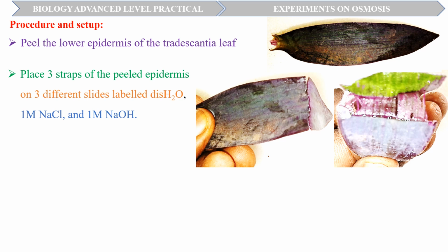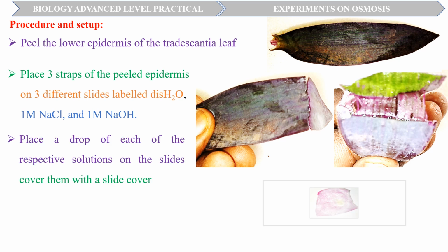Apply a drop of the solution on the slide. Cover with a slide cover and quickly observe under the microscope at times 40 or times 100 magnification. Then allow the slides to stand for 10 minutes and then observe again.